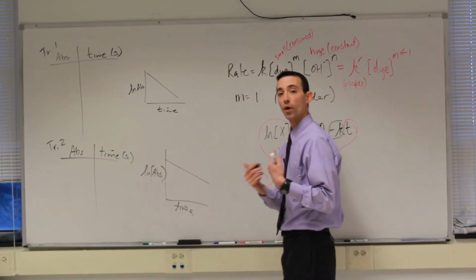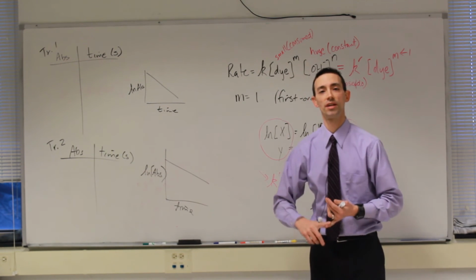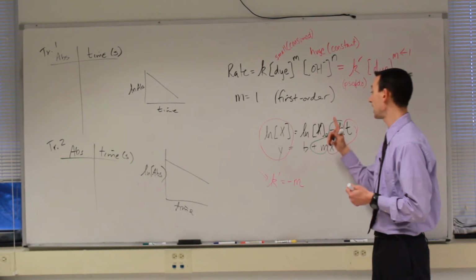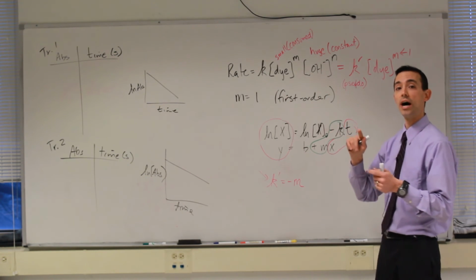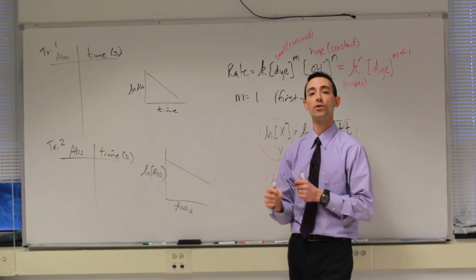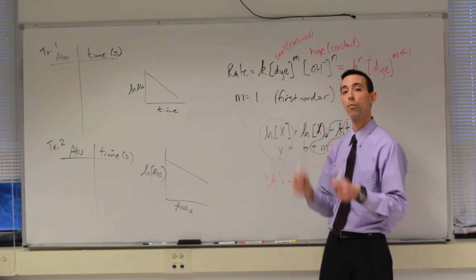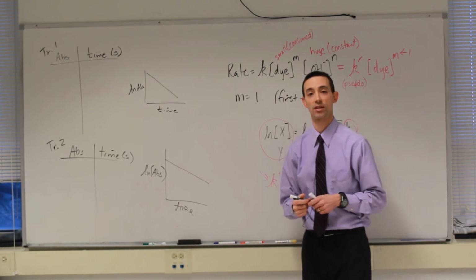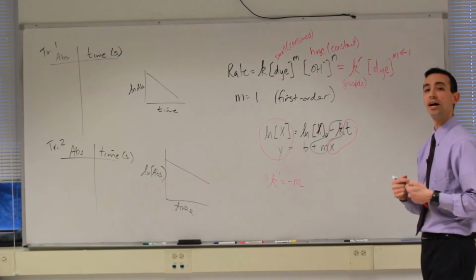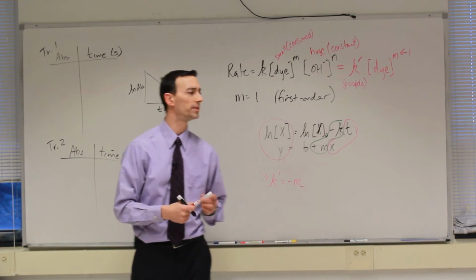Other things that you need to record, as indicated in your lab manual, are the concentrations of particularly the hydroxide ion and how much you added to the reaction so that you can calculate the concentration of hydroxide once the reaction is mixed. And that is done using the standard dilution rule that we've learned how to use in Chemistry 1. All right?